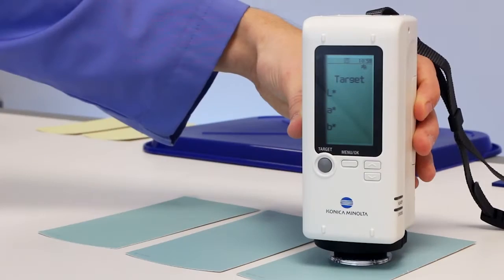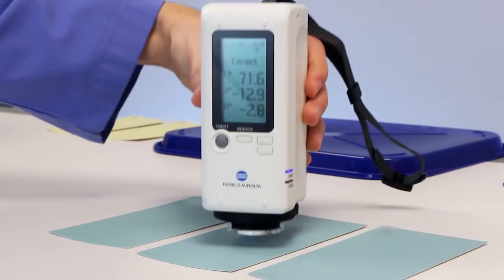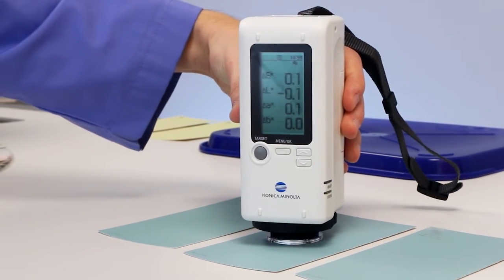Measurements are set in the standard Illuminant D65 with a 10-degree observer and specular component included.